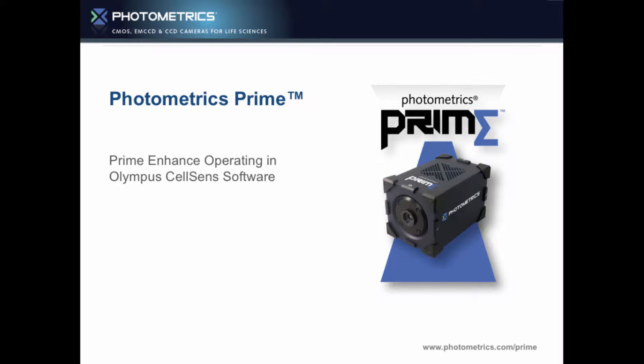This is just a quick movie to show you how Prime Enhance, our special denoising function on the Photometrix Prime camera, is working and operating inside Olympus CellSense software.